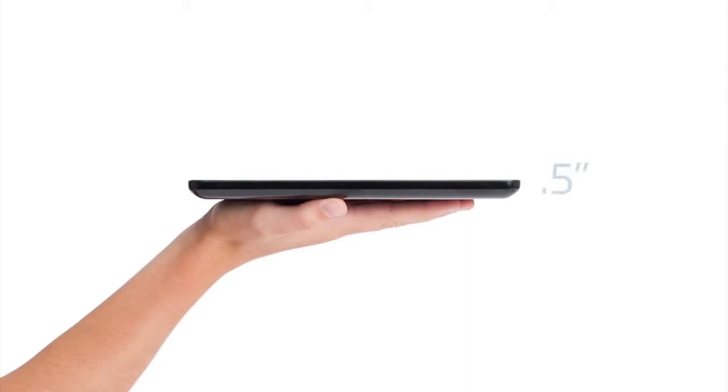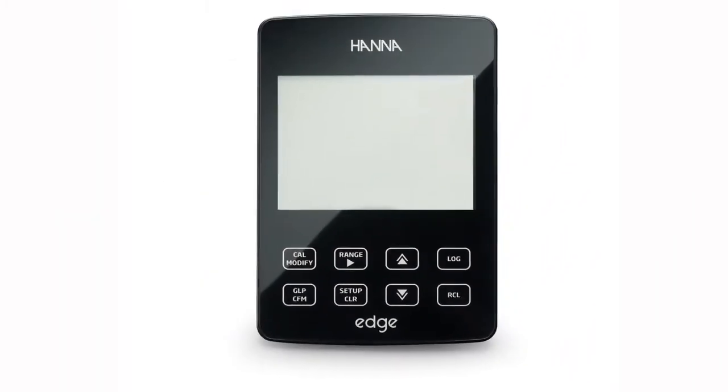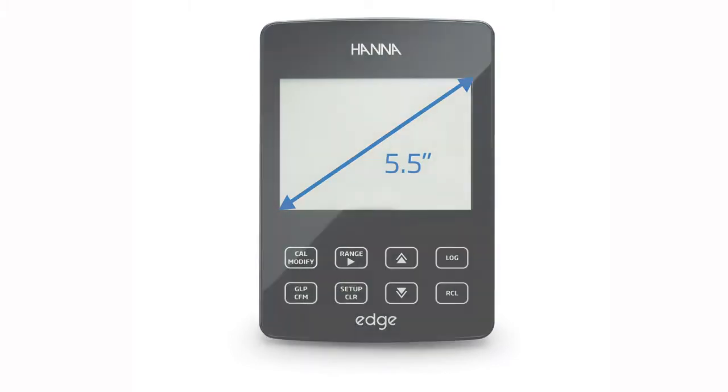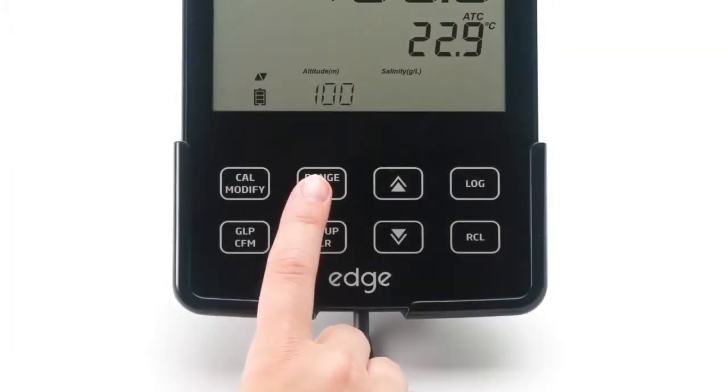EDGE is incredibly thin and lightweight, measuring a half-inch thick and weighing only 8.8 ounces. EDGE features a 5.5-inch LCD display that can clearly be viewed from over 5 meters away, and a capacitive touch keypad that gives a distinctive, modern look.